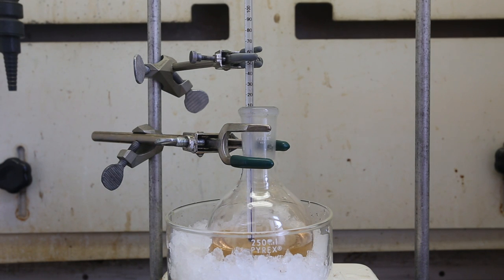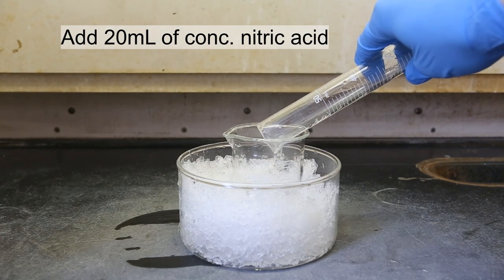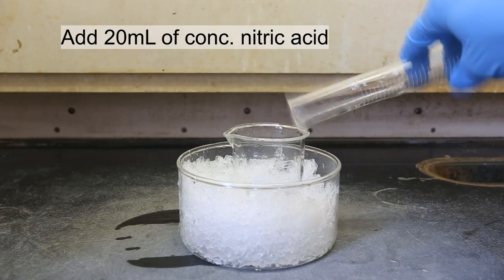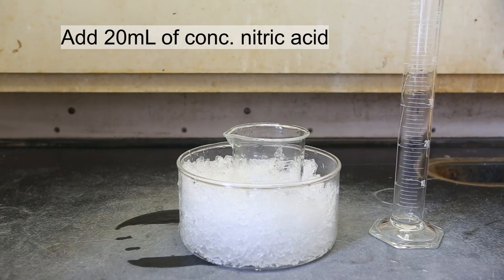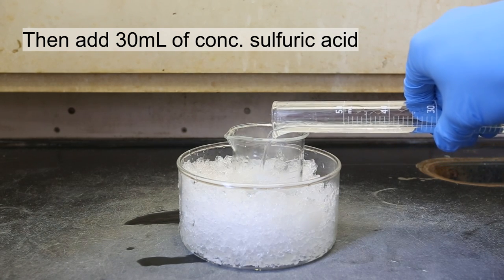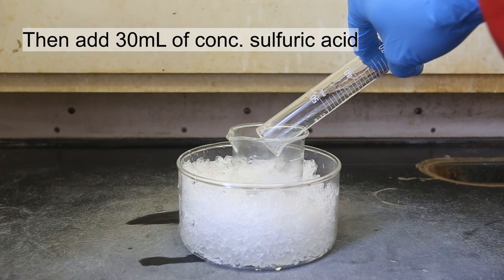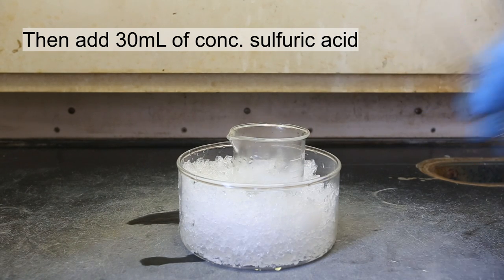Leave the solution stirring on ice until the temperature reaches about 5 to 10 degrees Celsius. In the meantime, an ice-cold nitrating mixture should be prepared. With a beaker on ice, add about 20 milliliters of nitric acid. Let the nitric acid cool for a little bit. Then, add about 30 milliliters of concentrated sulfuric acid. Let the solution sit in the ice bath until it is ice cold. This should take probably about 15 minutes.